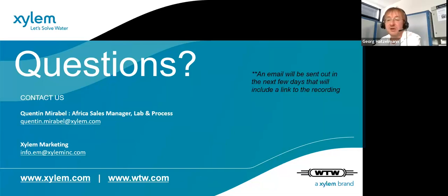When they start calibration, sometimes it blocks the measurement. This sounds typically like an old electrode which needs to be replaced. If not, please contact us and we can go into details. And now one is left, service related, contact to India. The same feedback, please contact Quentin so he can forward this to our team in India.